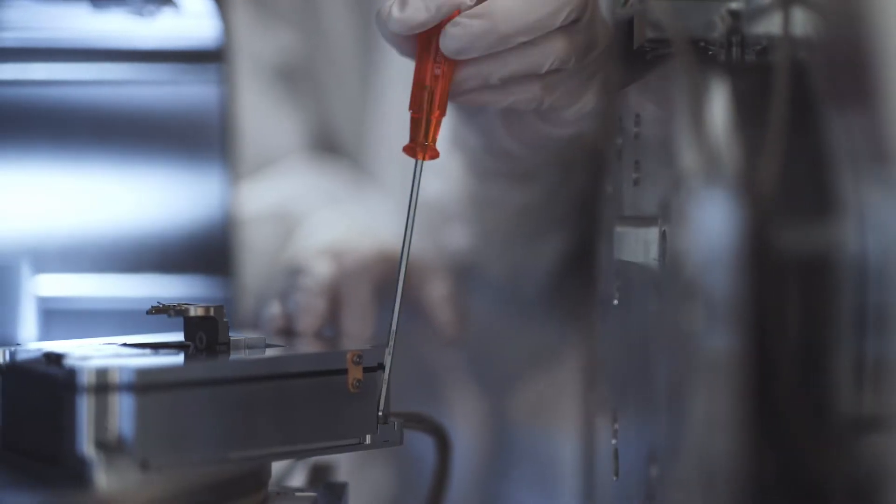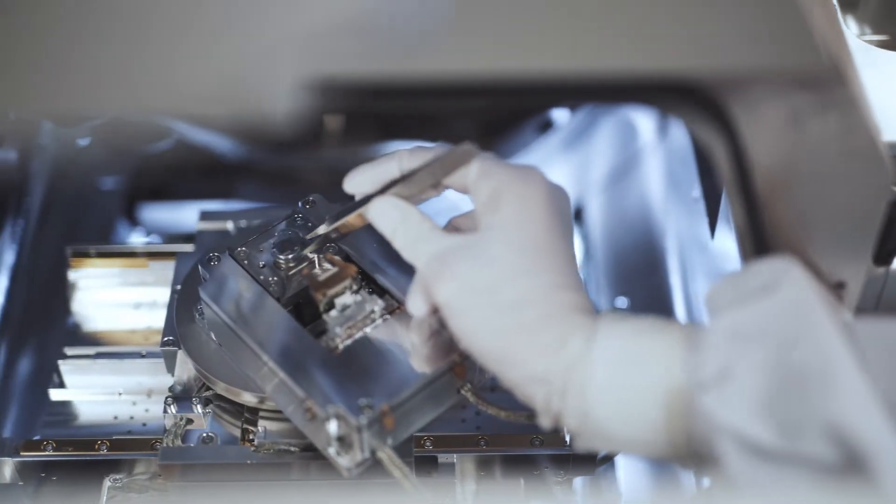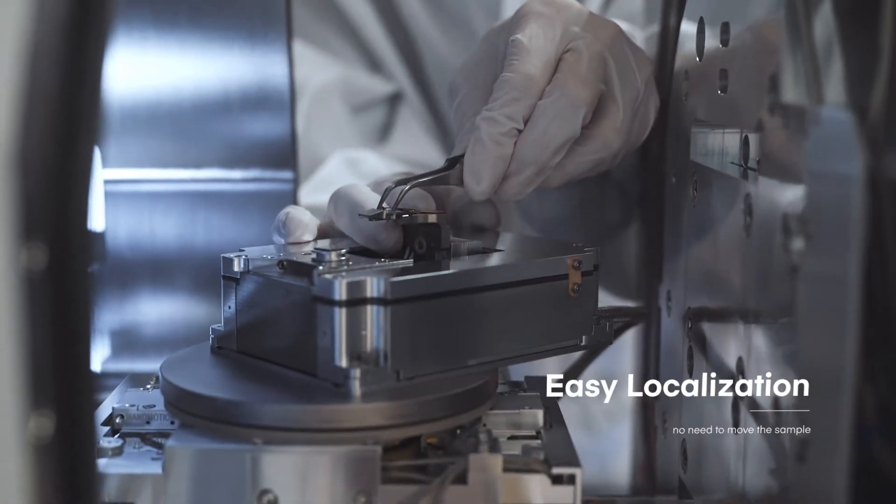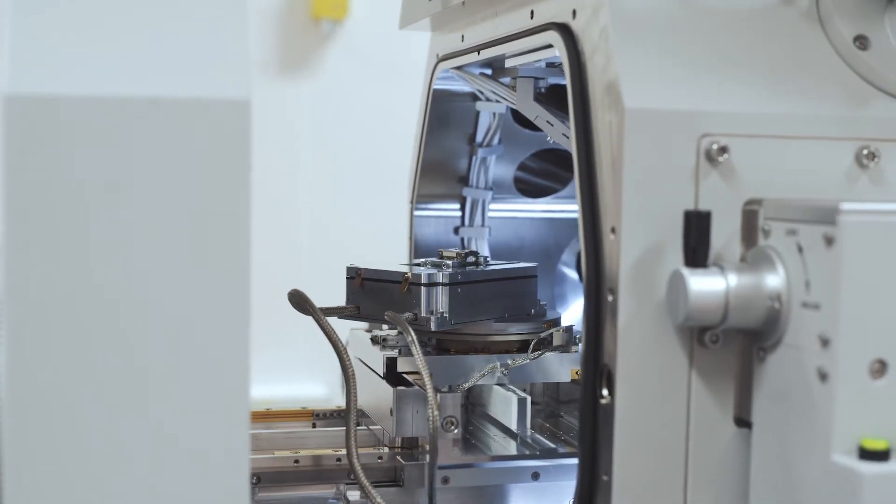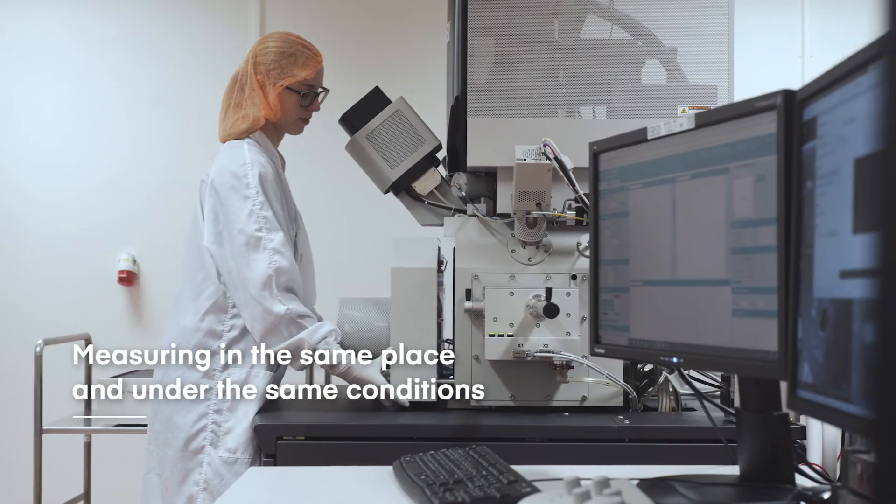Its integration into the SEM prevents sensitive samples from contamination or oxidation as the measuring is done in the same place and under the same conditions.